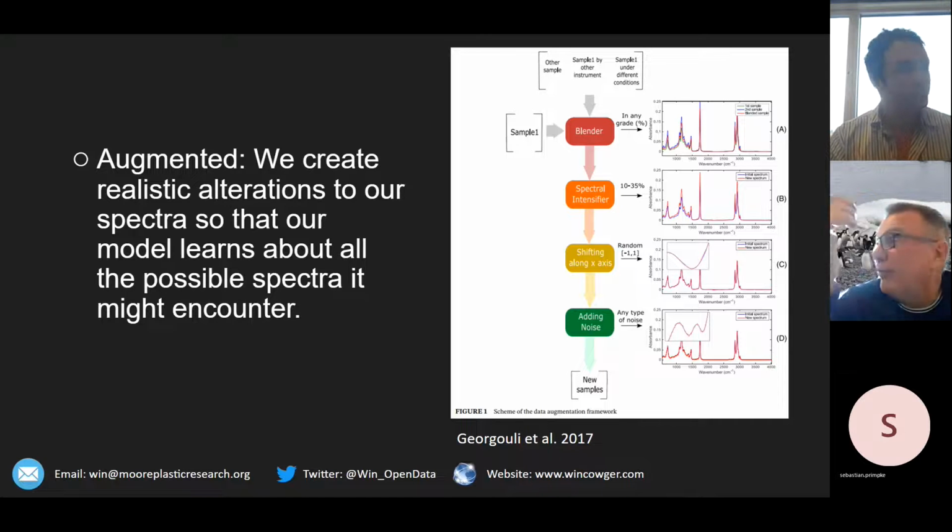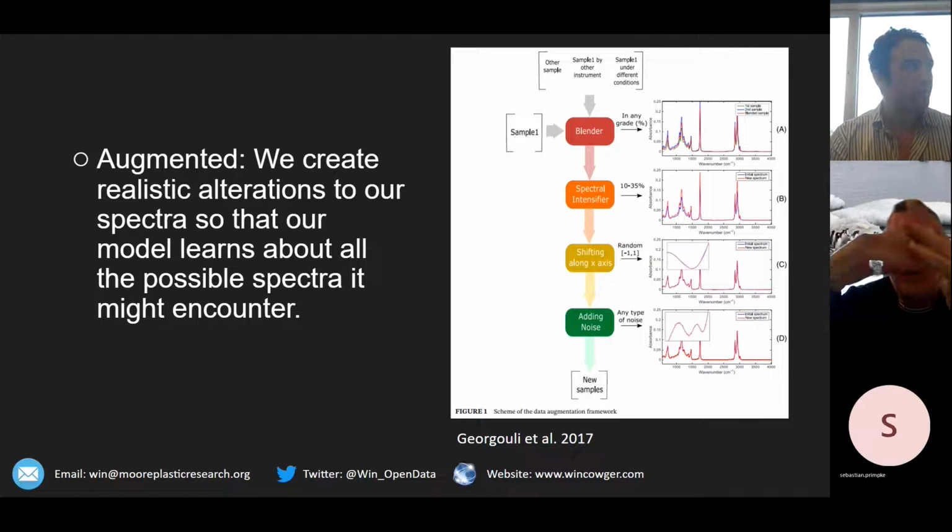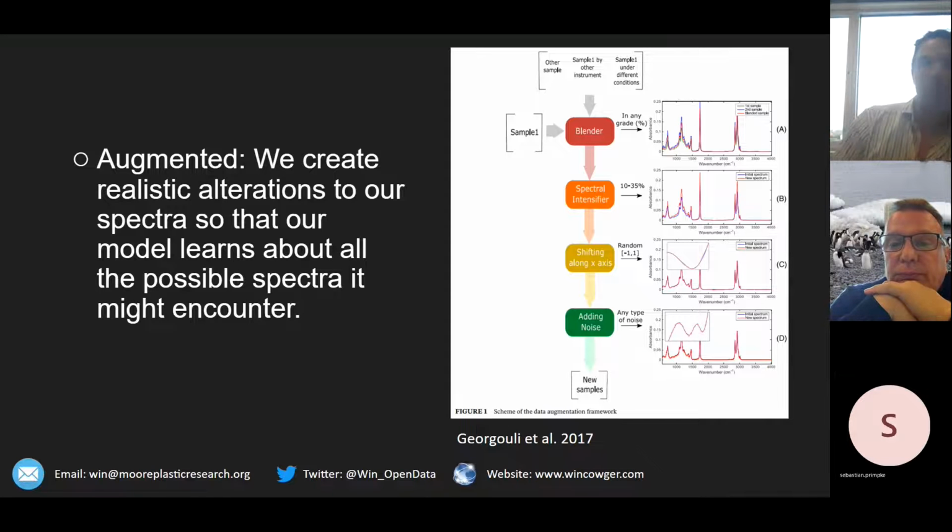So I don't think you will have to manually put in backgrounds. It might happen that if you have 100,000 spectra uploaded, there will be these 10 spectra which are lousy. You know that they still are these compounds, or these mixtures. I'm a little bit on the approach that you have. Thanks. Yeah, that's good feedback.